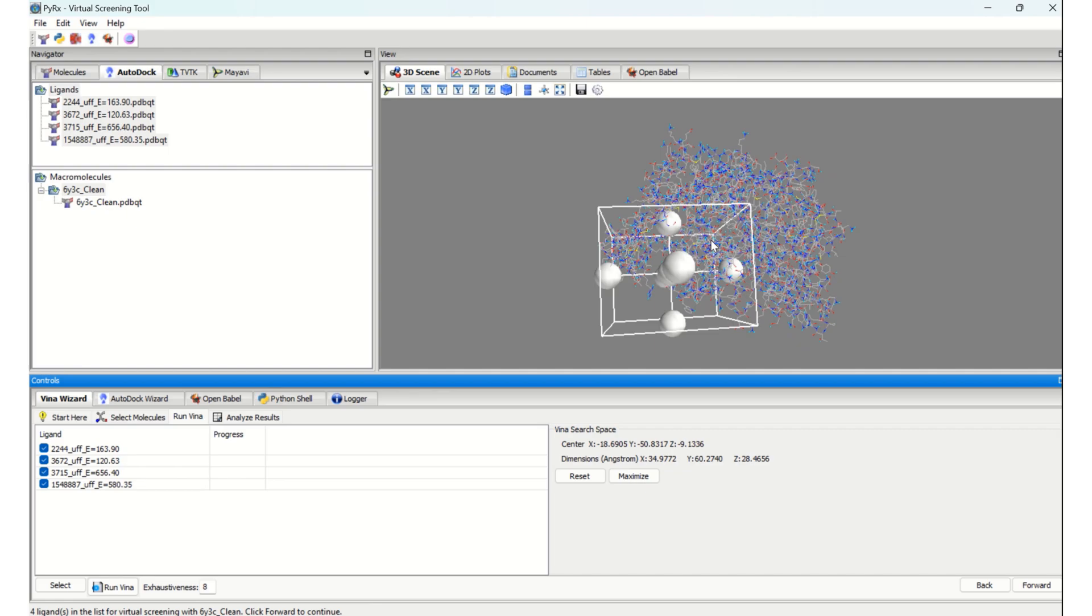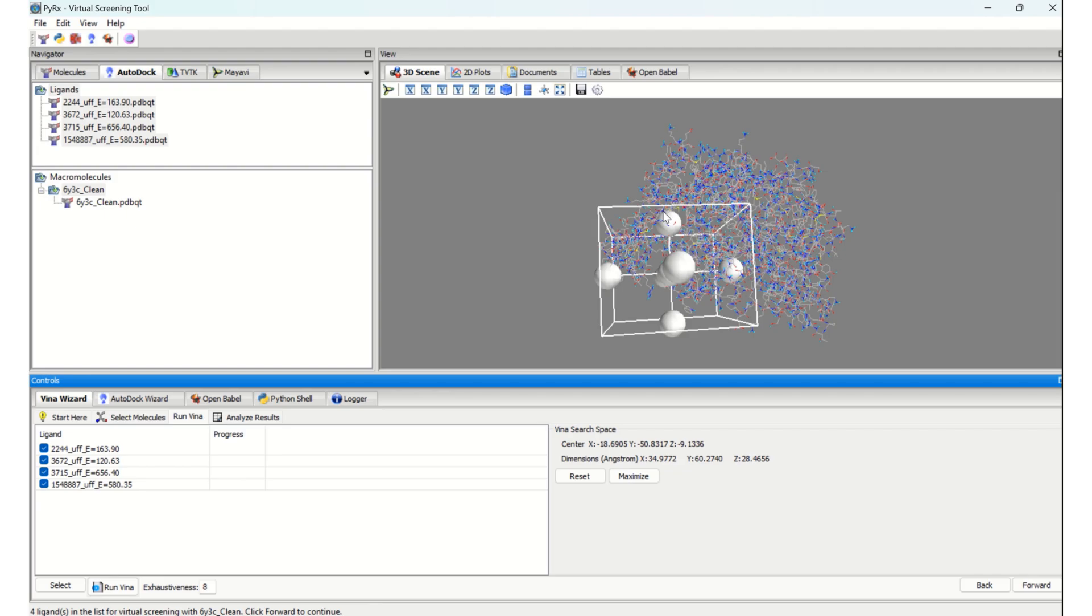So that I can run this Vina wizard very easily. Now, after selecting this particular area of the grid, you can see here the option 'Run Vina'. I am going to click on this Run Vina option.